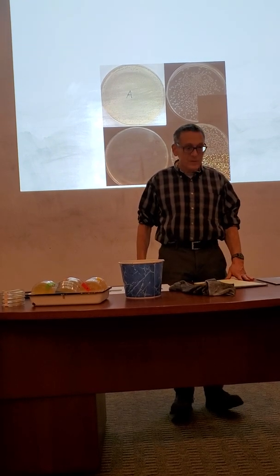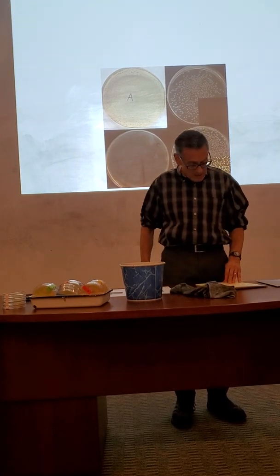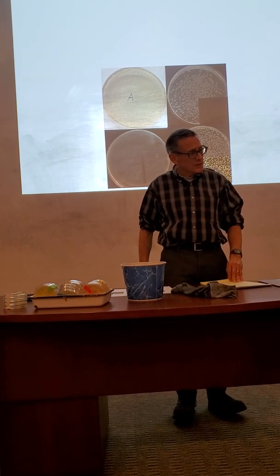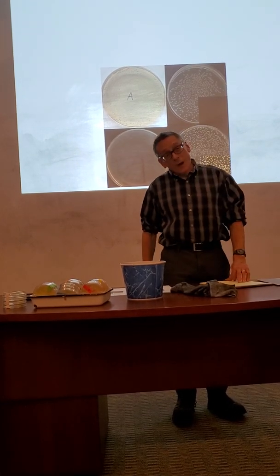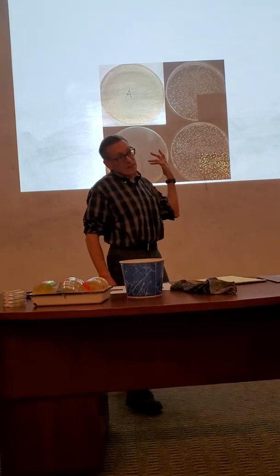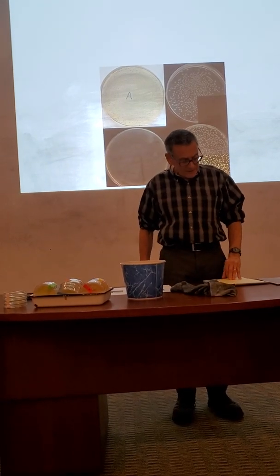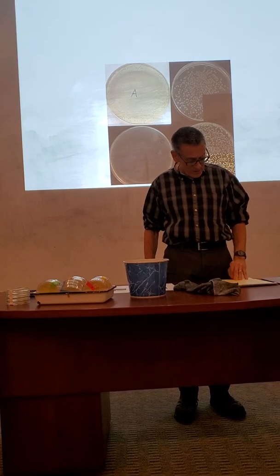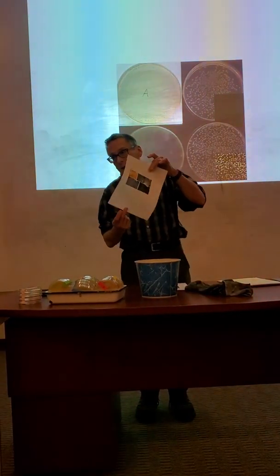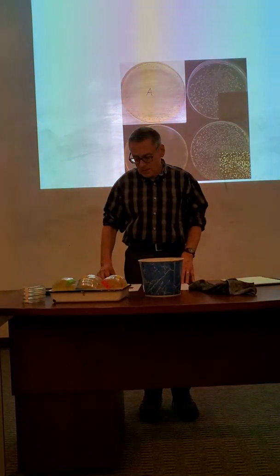XGAL, ampicillin, they're clearly important to the interpretation of this picture. I didn't stick it in the title. You might, but I'm certainly saving that up for the legend so that that information comes up. Maybe in the protocol, I want to tell my reader what's in these plates. Maybe when I describe that the control gave me what I think. So again, I'm grading this by a rubric, so you know what I'm looking for. The title, protocol, analysis, and some kind of helpful marking on whatever iteration of a photograph that you do decide to display.